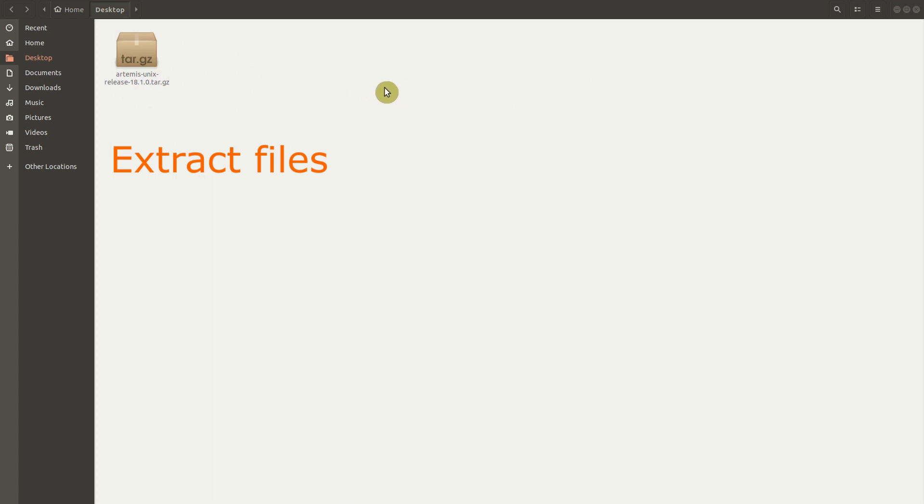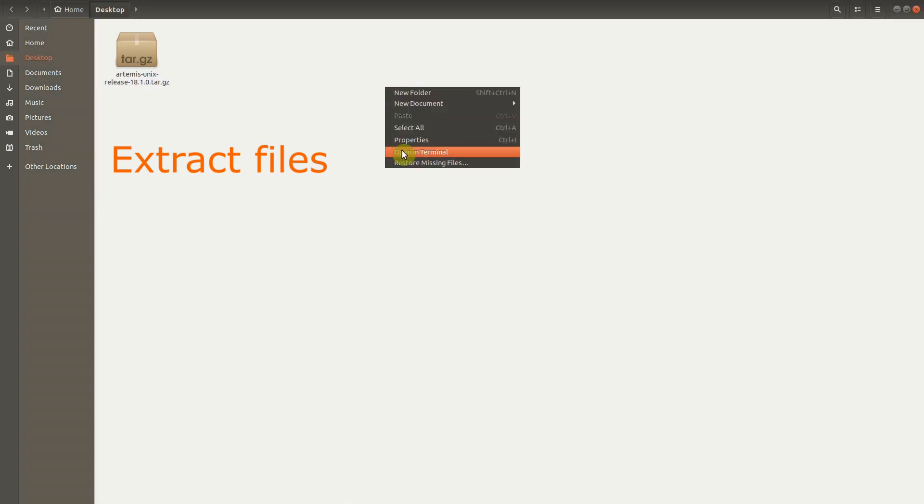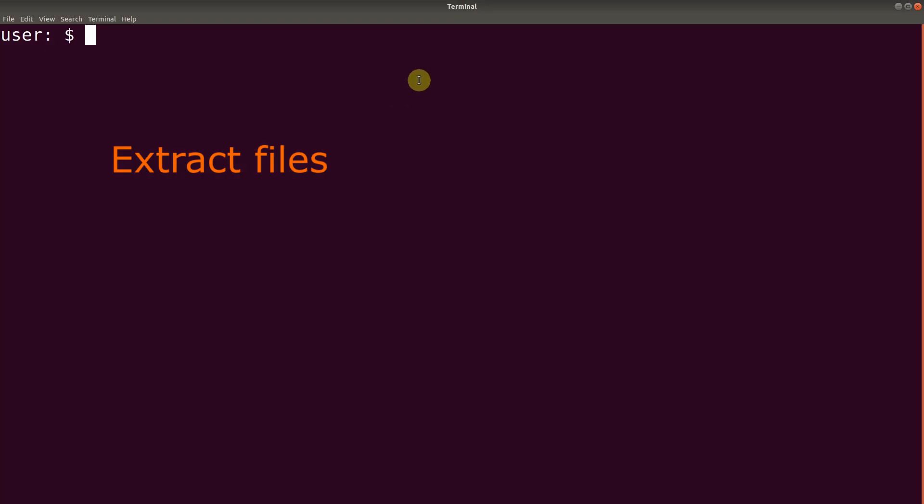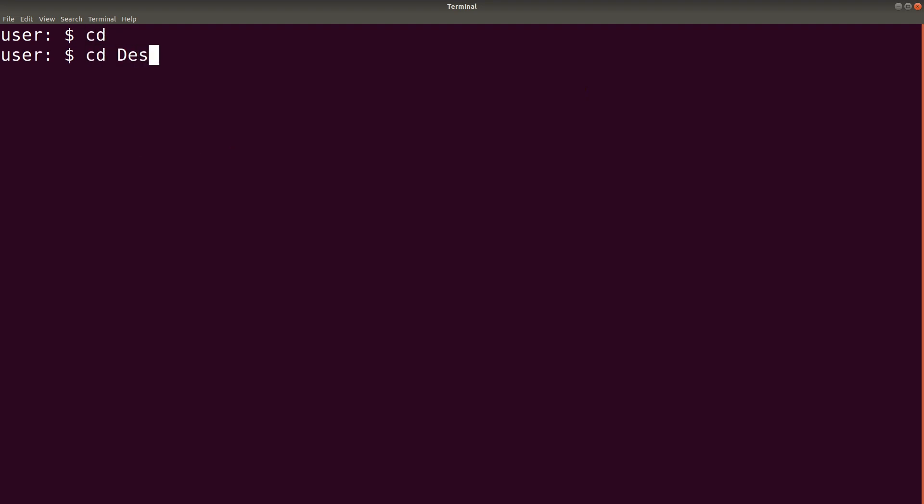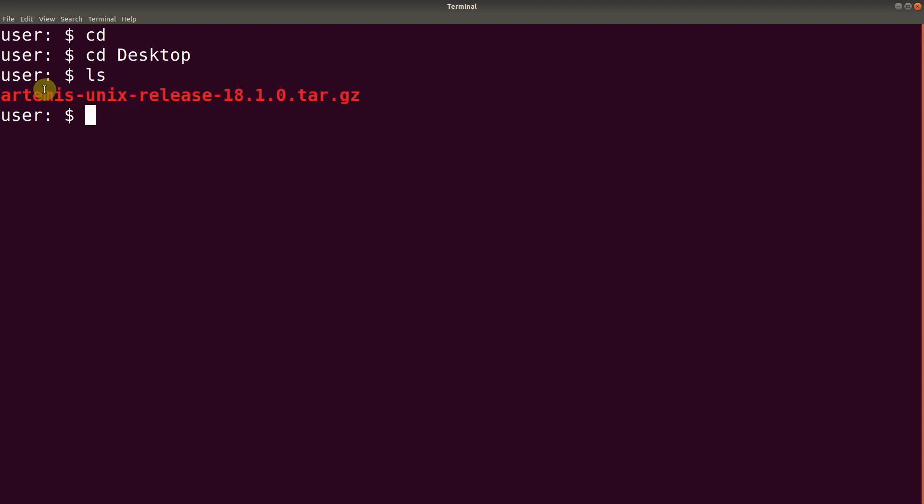So I'll go to my terminal. And then I'll navigate to where I downloaded it. It was on my desktop. So I'll just navigate to desktop. When I do an ls, you'll find the file there. So we extract it. And in Linux, in Unix, this is how we extract it.